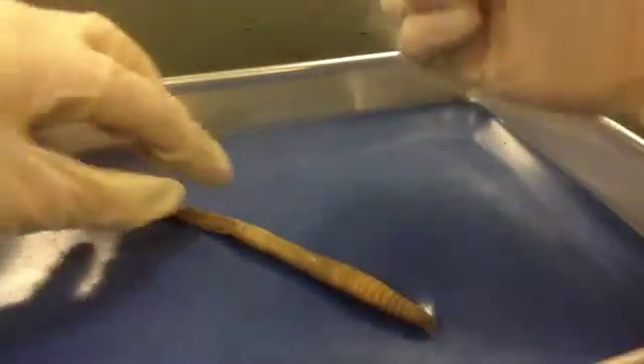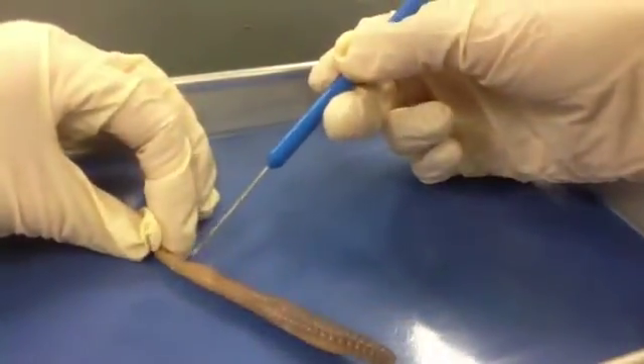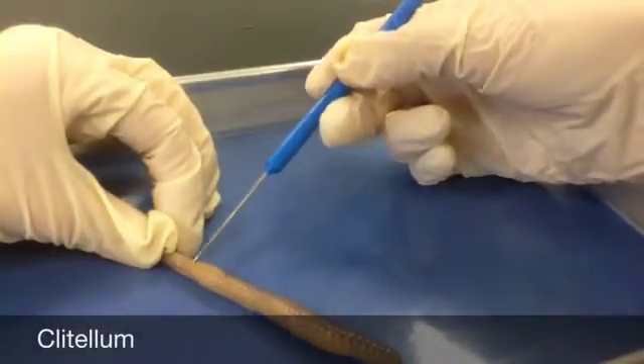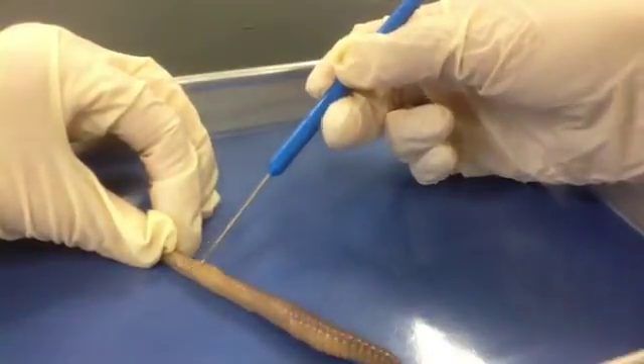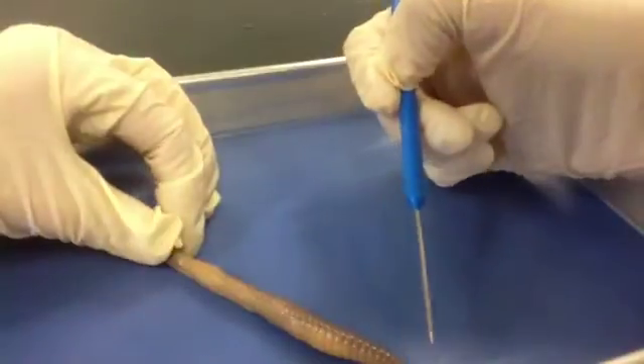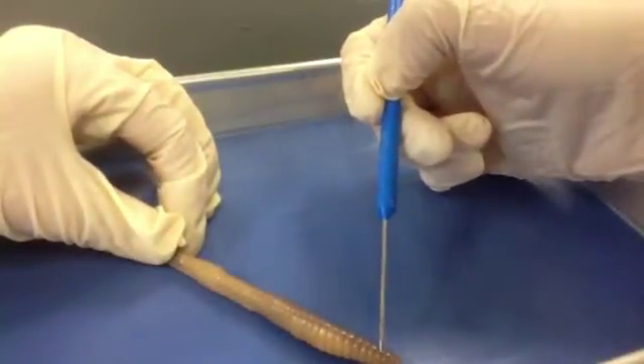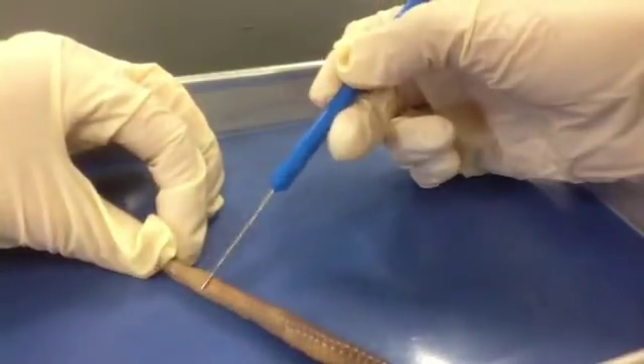If we look at our earthworm, and this is a little bit easier to see on the dorsal side, we have our clitellum, which is going to be from about segment 33 to 37. You can count the segments if you start all the way up at the prostomium and go 1, 2, 3, 4, etc. So again, this is our clitellum right here.